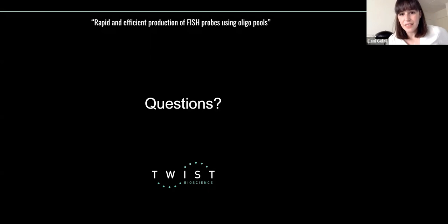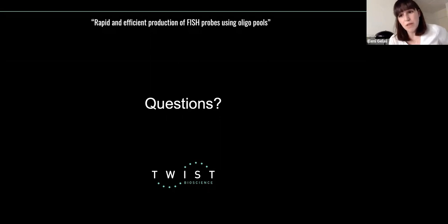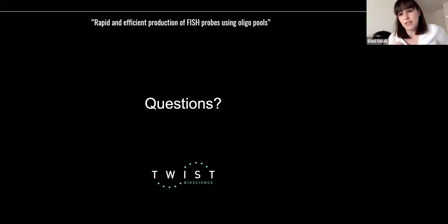Yes, we have tried different numbers. I think to be on the safe side, you need to have 48, but there are probes that have worked with 24 also, though not always. And for smFISH, I think you can go much lower than 48. I have gained very good results with 36 probes. But going to 10 or 20, I think then it starts being shaky on how well you detect the loci.